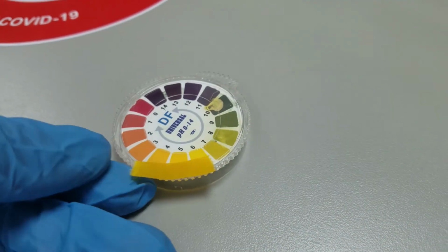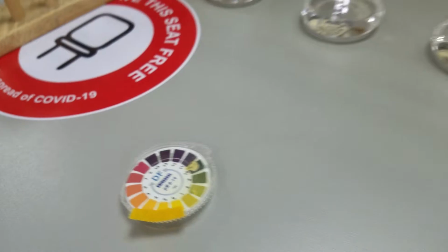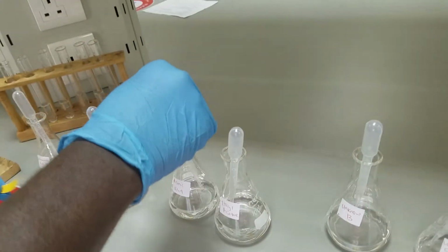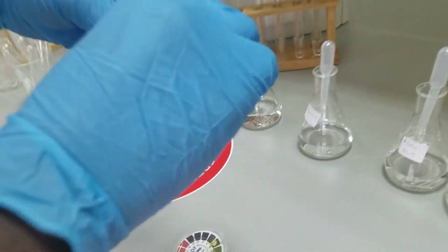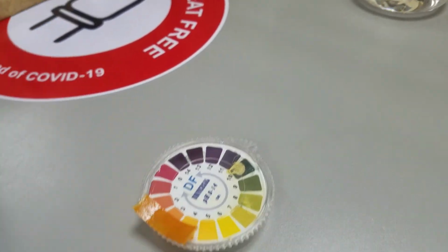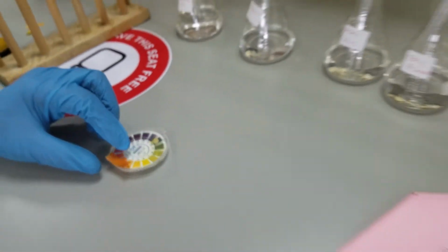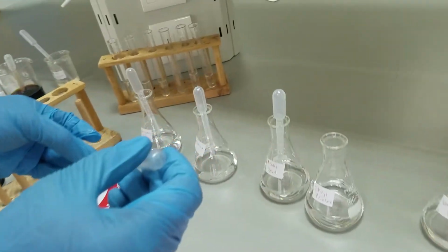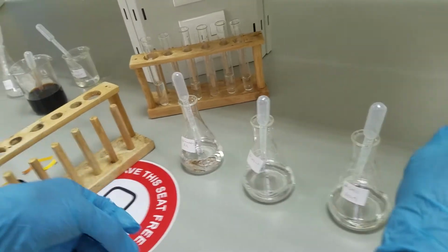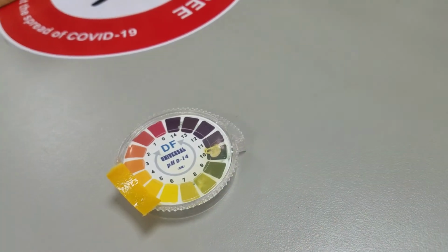This is the wheel. See where it falls. Our third one is acetic acid. This is the wheel. See where it falls and record. Our fourth one is ethyl acetate. On the wheel. See where it falls.